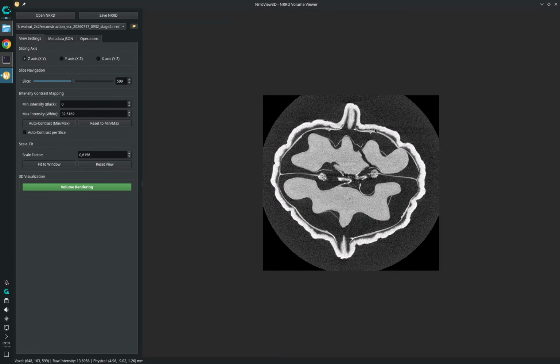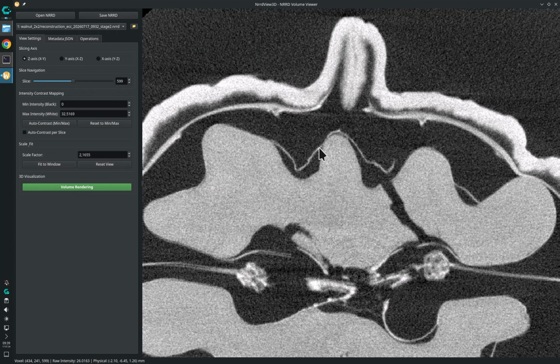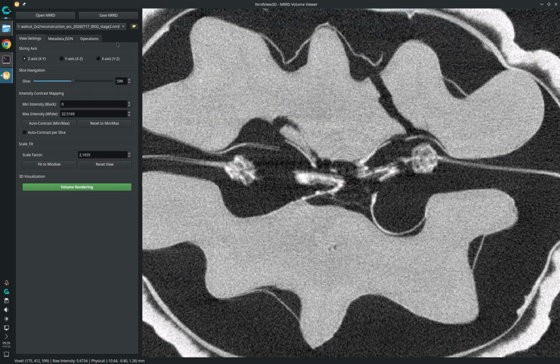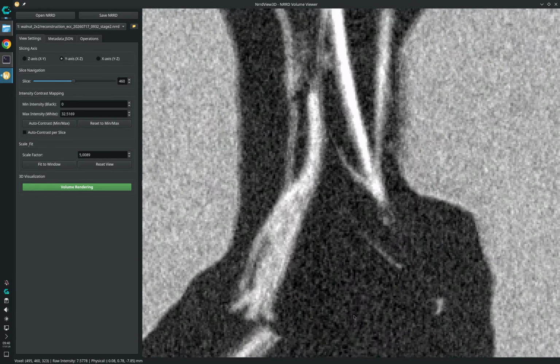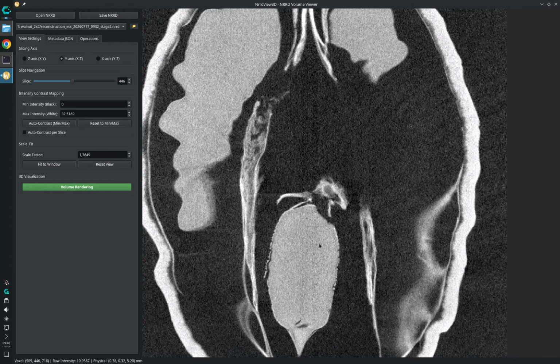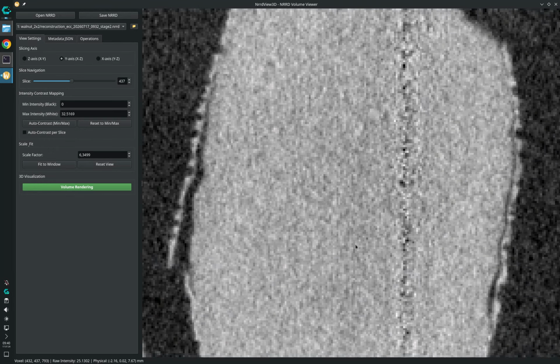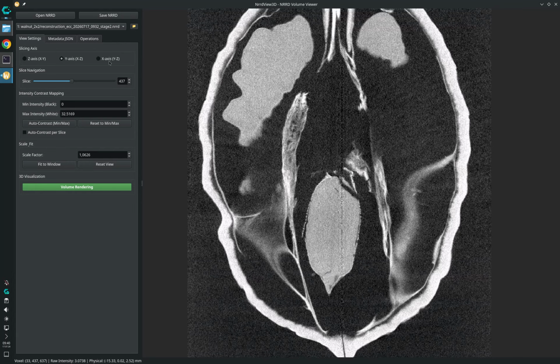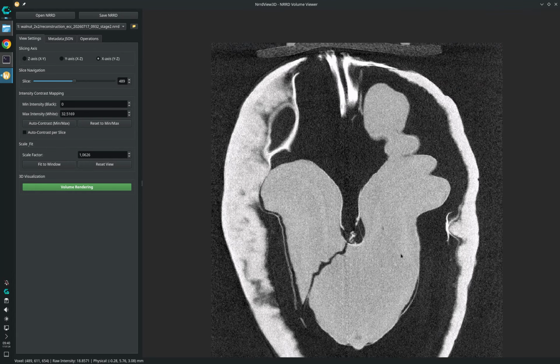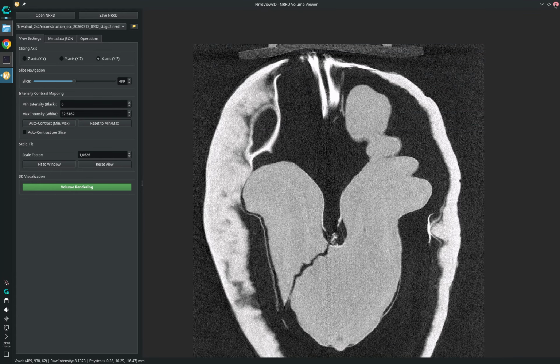This is the result. And yeah, there's still quite a bit of a double edge here. This looks pretty good. Let's look at another. Yeah, no. I don't know. This is definitely not the best correction I've ever done. But in some places you can see it's actually pretty good. Very much depends on what you're looking at, I suppose. Yeah, this looks rather good, I think. Okay, so anyway, this is where we are.